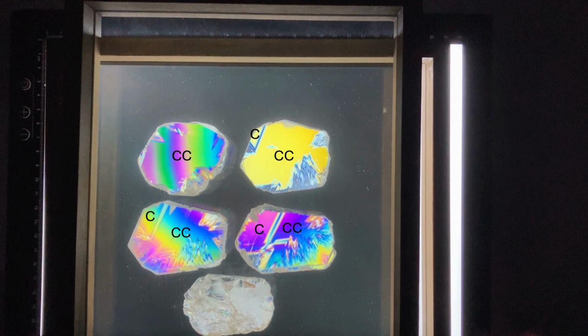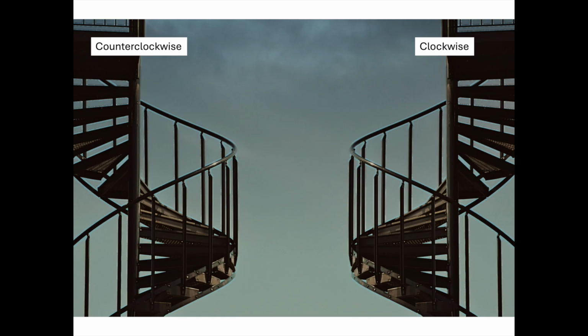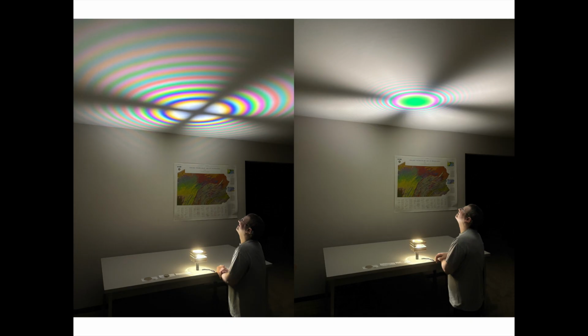To recap what we did today, we talked about Brazil Law twinning in quartz. You can think of part of the quartz crystal structure as a spiral staircase. And because our quartz crystals have this spiral staircase, they also have an interesting optical property known as optical activity. This optical activity allows our quartz crystal to rotate the plane of our plane polarized light as it travels through our crystal. This allows quartz to generate a fairly unique uniaxial optic axis interference figure.